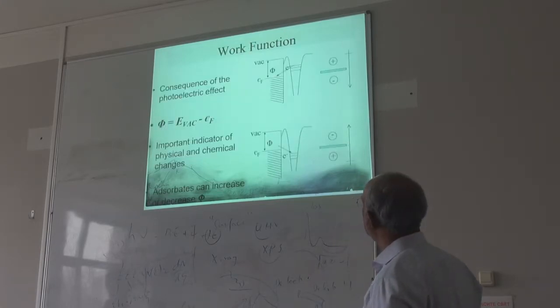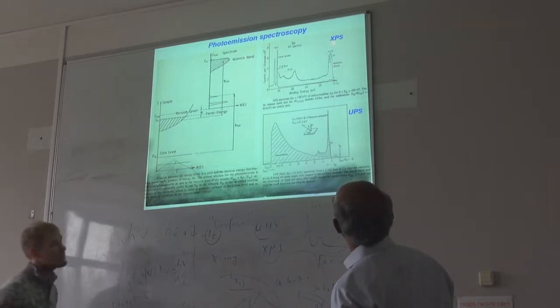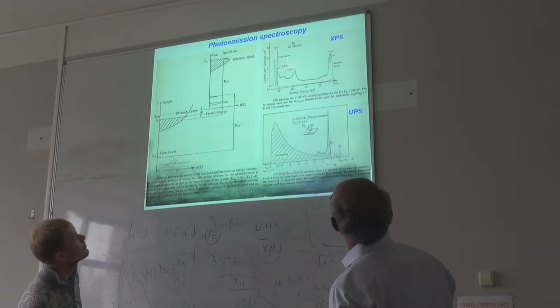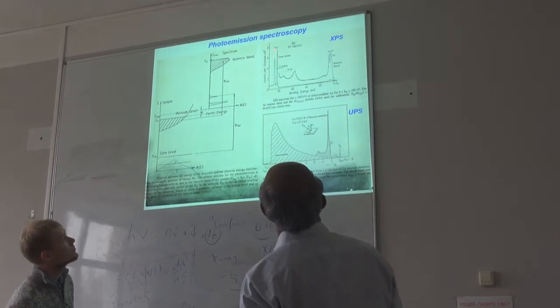So if you look at any, here is some spectrum of the XPS. You can see different features coming from gold. This is all coming from the core levels, right? So even gold 5d, gold, this one, so L1 or something.